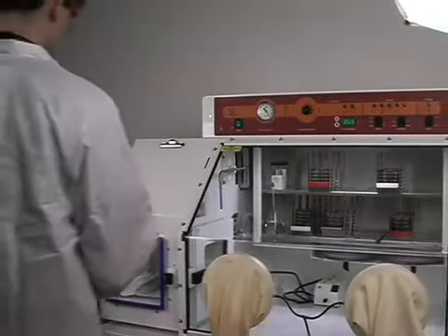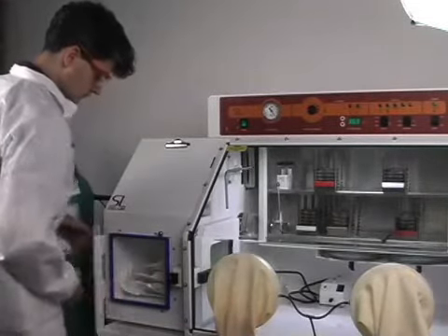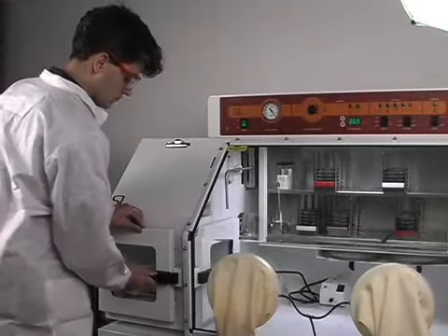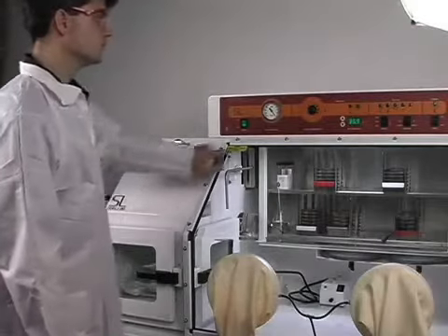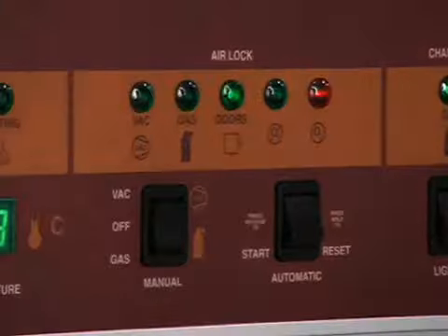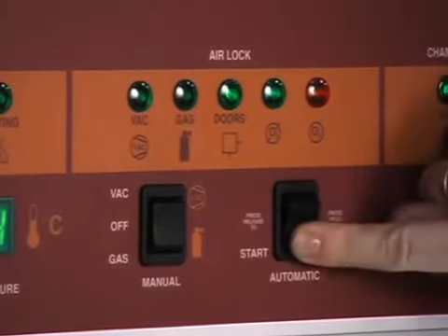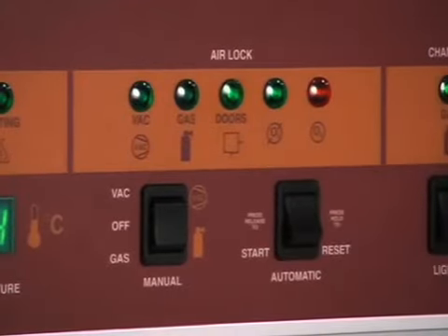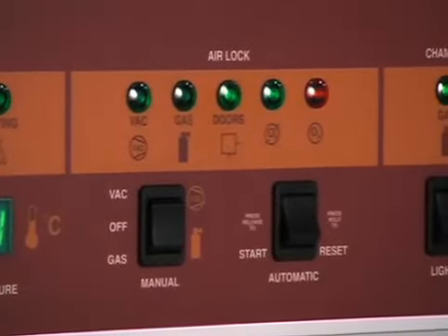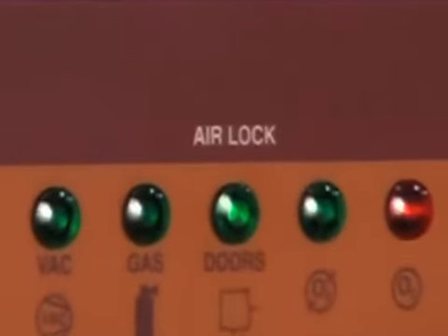Entry into the chamber begins with the automated airlock system. Once all of your materials are in the airlock, simply start the automated process by depressing the auto-cycle button. The unit automatically vacuums down to 18 inches of mercury while removing internal atmosphere. Then it displaces the airlock atmosphere with nitrogen during the first two cycles, and finally with AMG during the final cycle.